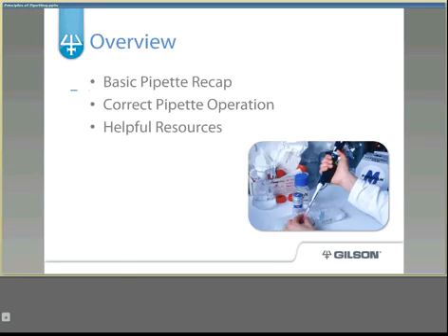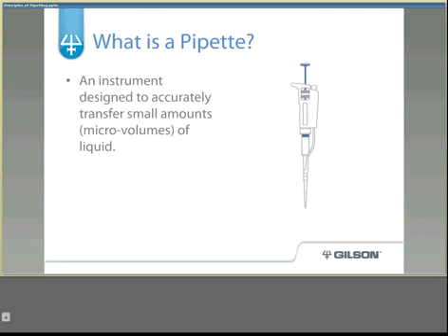Welcome to the Principles of Pipetting. A pipette is an instrument designed to accurately transfer small amounts of liquid, anywhere from fractions of a microliter up to milliliters. They can be used for a wide variety of applications including PCR, DNA extractions, and water testing.